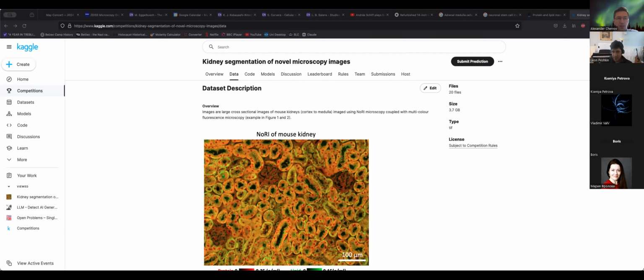Leonid, as you describe the task, it seems to be quite complicated. For each pixel, you want to get something like a parsing. For me, it's a little bit unusual. Yes, so kind of what task? Sure, this is kind of similar. So there are many, many subtasks here, right? The first subtask is segmentation of tubules.